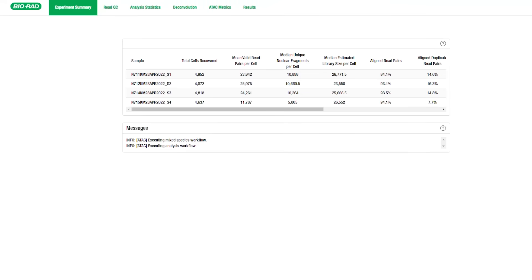The first tab, Experiment Summary, summarizes key metrics and statistics for each sample. It also contains any status messages produced by Omniscient.